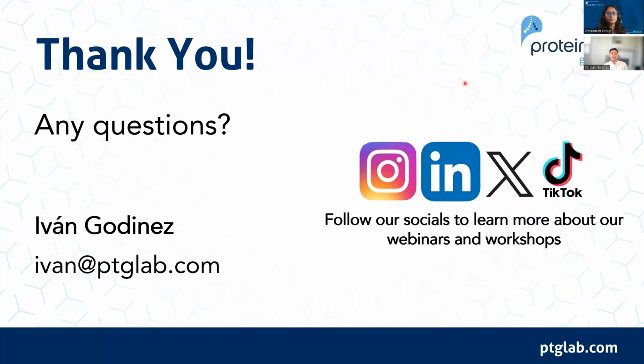So in terms of the mouse work we've done in-house at Proteintech Genomics, that is something that is on our roadmap. We will begin screening our antibodies against mouse samples, so splenocytes and other cells derived from different tissues. And we hope to complete that either by the end of this year or early next year. So it is coming. You know, the single cell world is split pretty evenly between mouse and human cells, so we want to make sure that we serve both of those communities adequately.